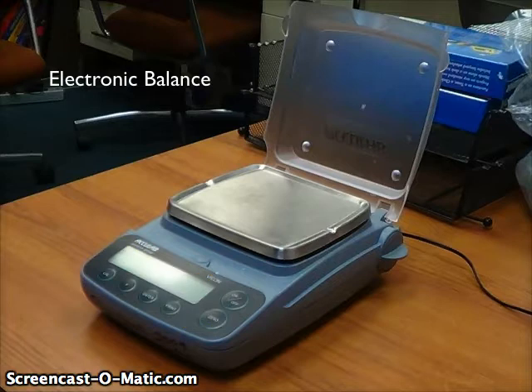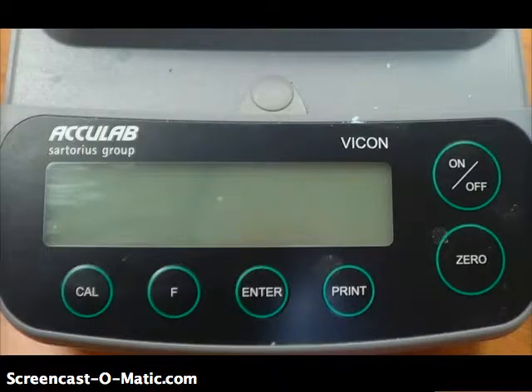Let's take a closer look at that window. There are a whole bunch of buttons on here, but there are really only two that we're interested in. First, the on-off button, which turns the machine on or off, and the zero button, which we'll get into a little bit later.